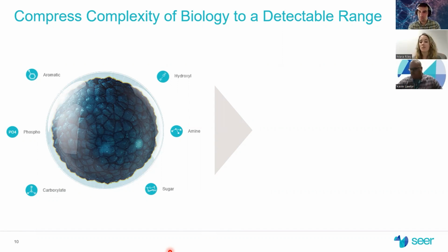At a high level, we can tune these nano-bio interactions at 2 different levels. So one, we can change the surface decoration of these particles with literally all known organic and inorganic chemistries. So I've done just a very small selection, as an example around this nanoparticle on the screen now, but it doesn't have to stop there. And then we can also change the corona formation conditions and competition between proteins for binding in the assay as well.